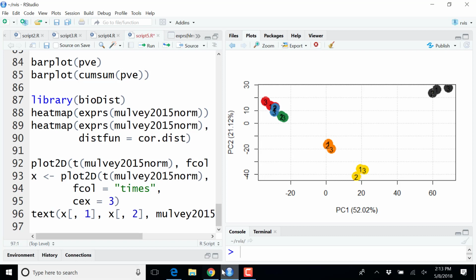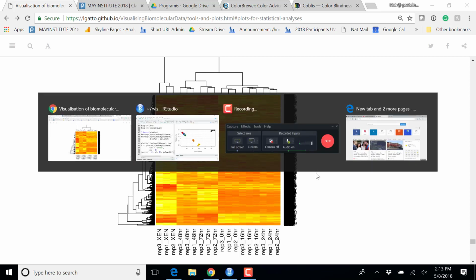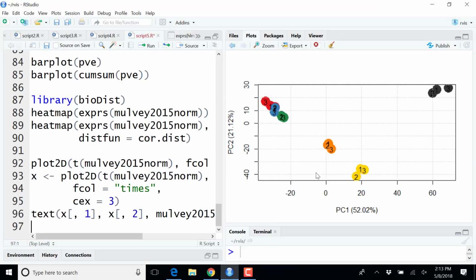So, yeah, I think this is a bit of an information overload without being able to extract information easily. But I think we should add that PCAs are informative if they're explaining a major amount of variance. Sometimes you see PCAs where one of the PCs is 2%, another is 1%. Then it doesn't really say anything because you're reducing all that data to them. You are absolutely right. And in this case, we see that this PCA explains over 70% of variability. So this is meaningful.